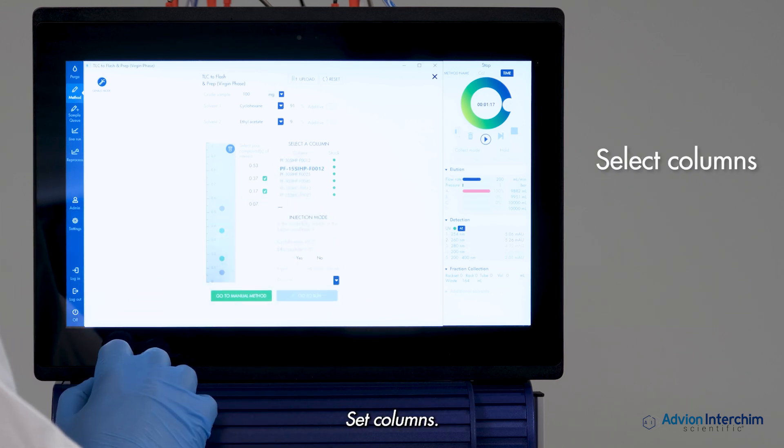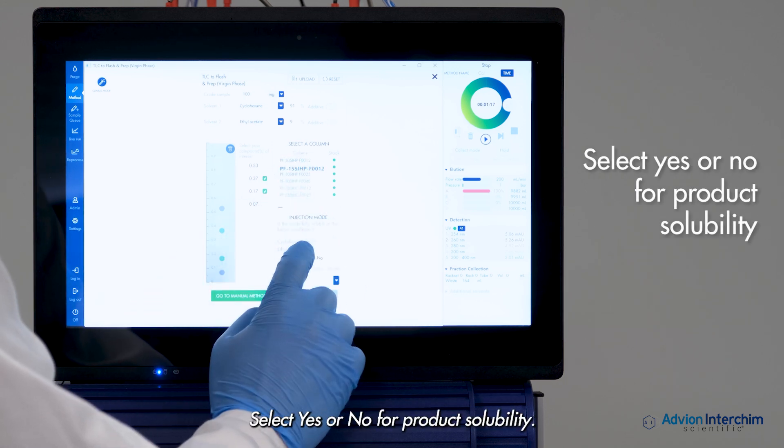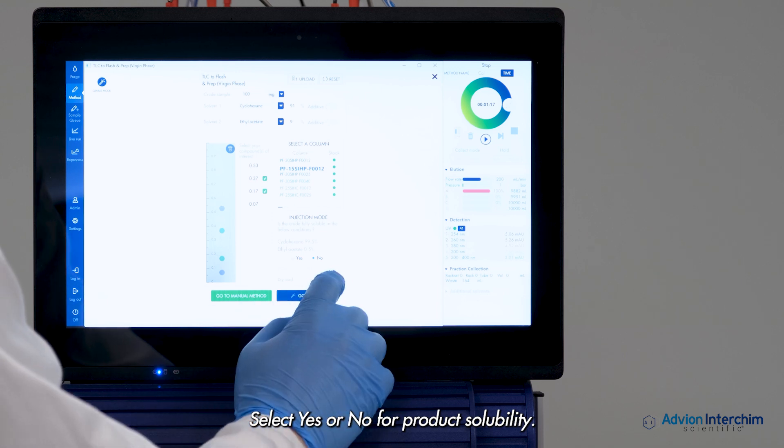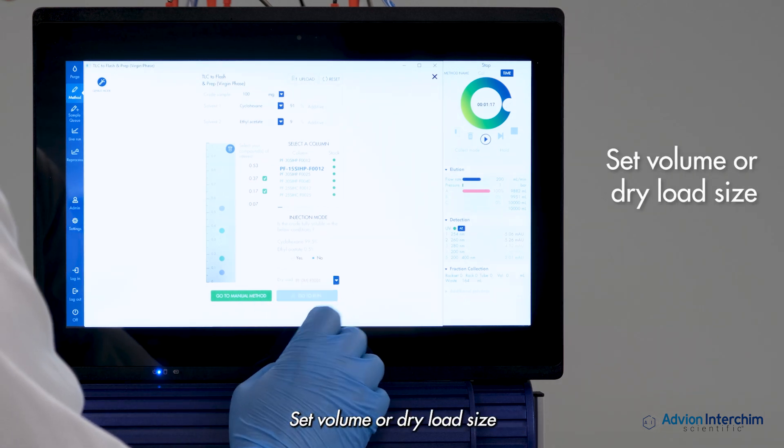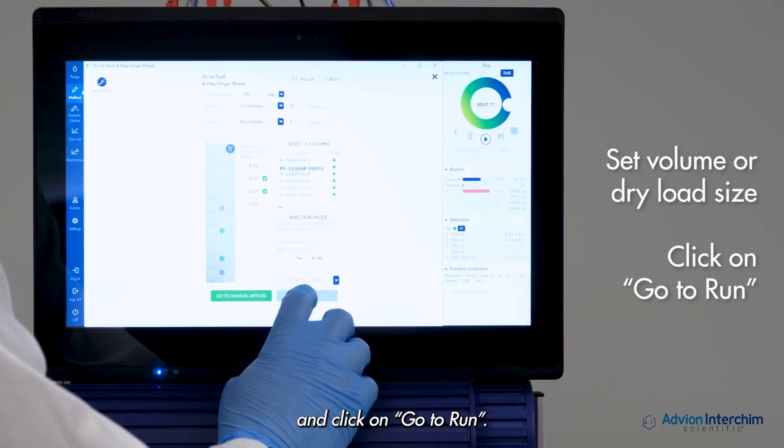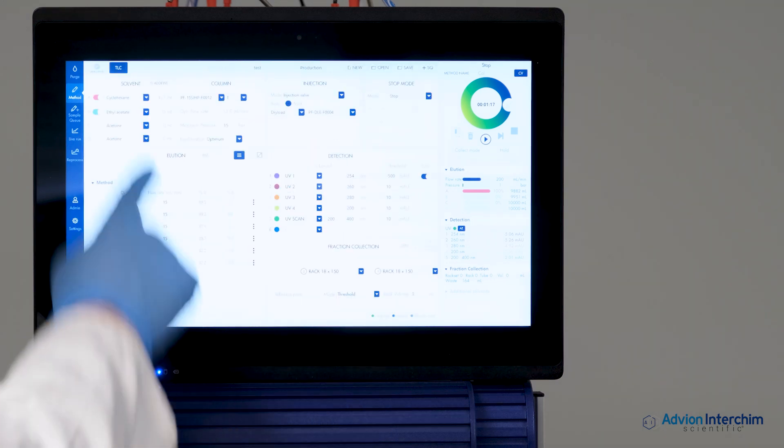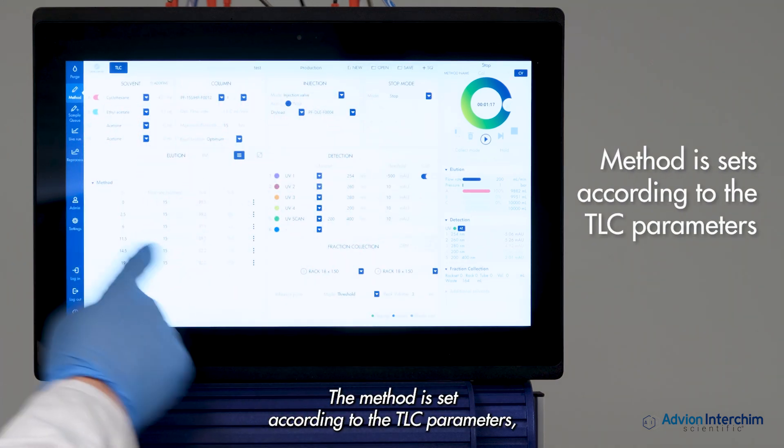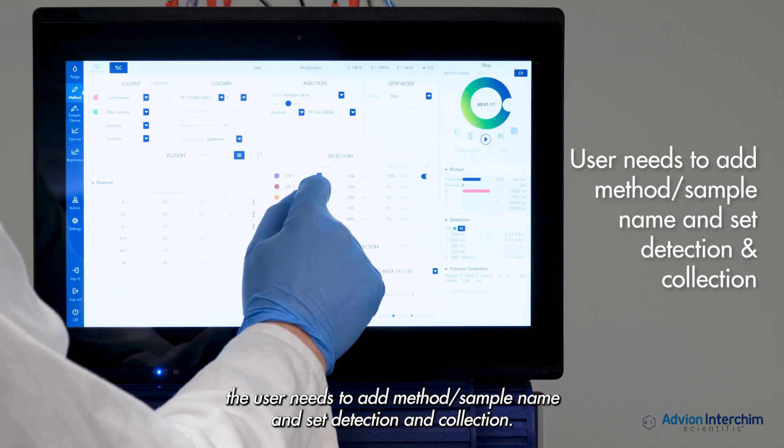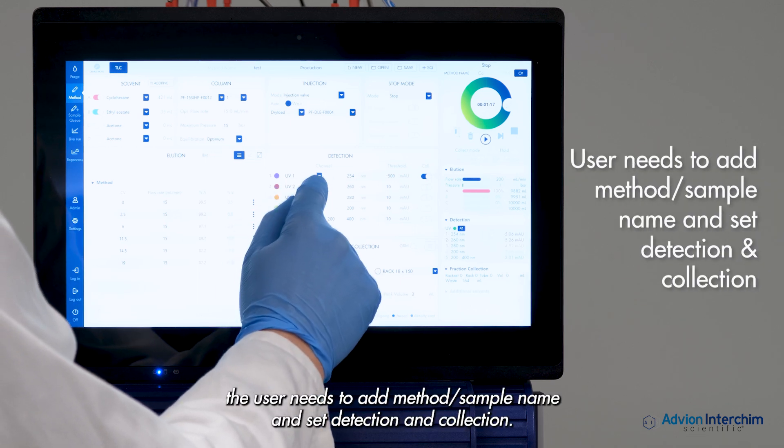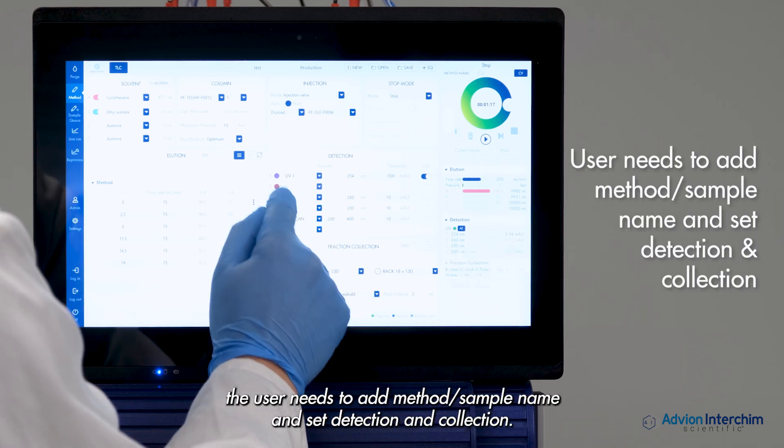Set columns, select yes or no for product solubility, set volume or dry load size, and click Go to Run. The method is set according to the TLC parameters. The user needs to add method, sample name, and set detection and collection.